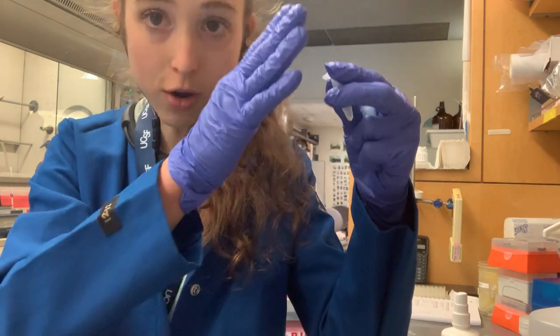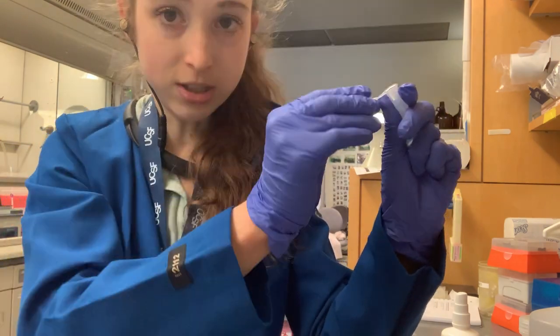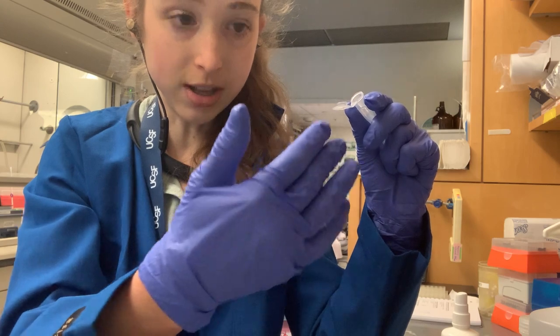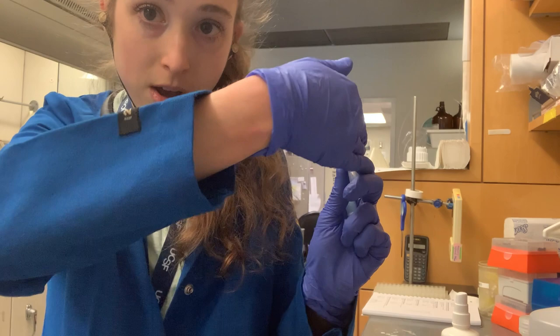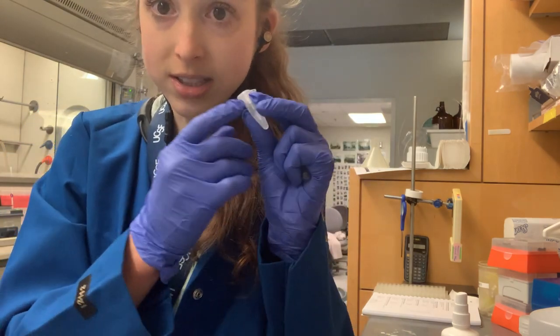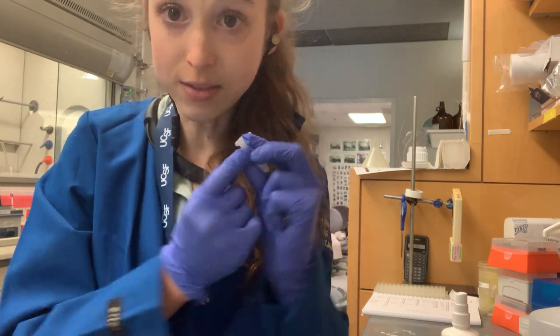Speaking of which, you can put the lid open towards the rotor at an angle — if you have a bunch of them, position them so they're not all hitting each other. Make sure it's going in the direction of the centrifuge flow so it doesn't snap off. But you also want to label the side of the tube in case the lid does snap off, and because you can fit more information on the side of the tube.